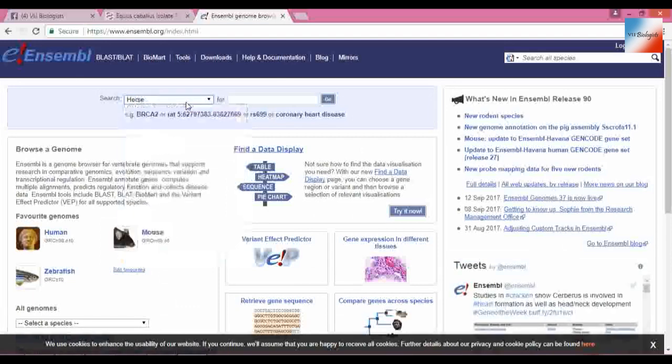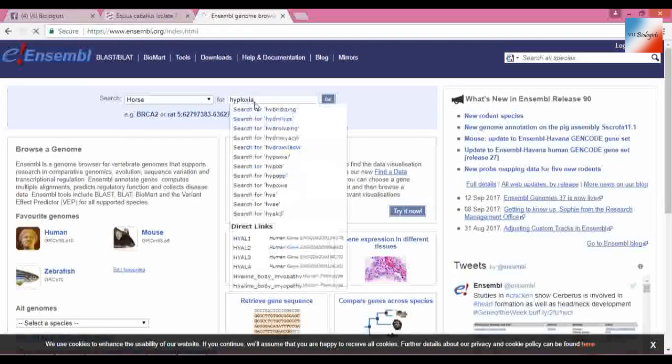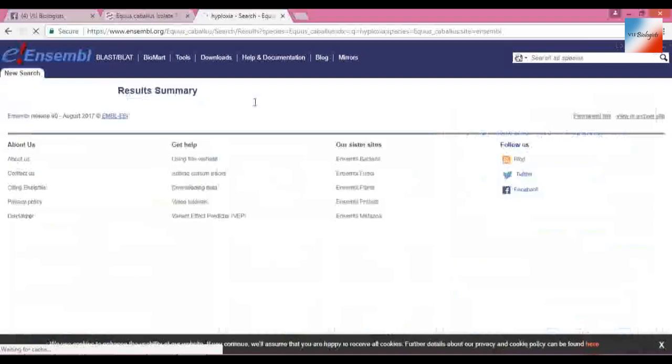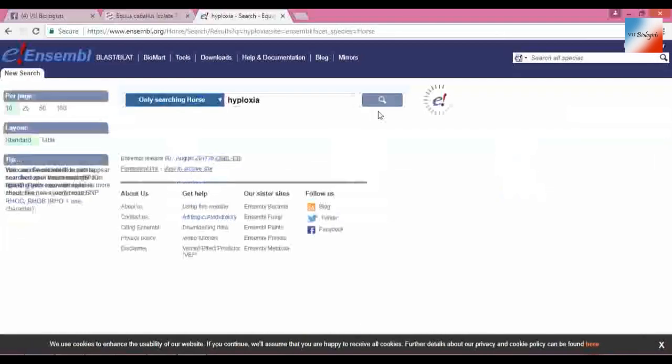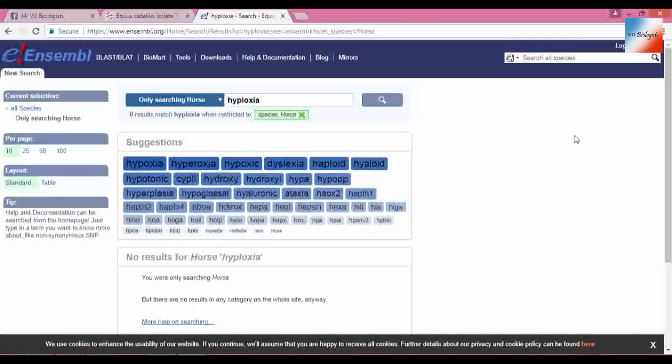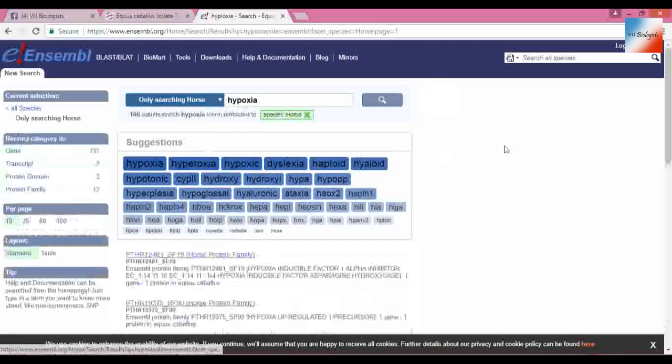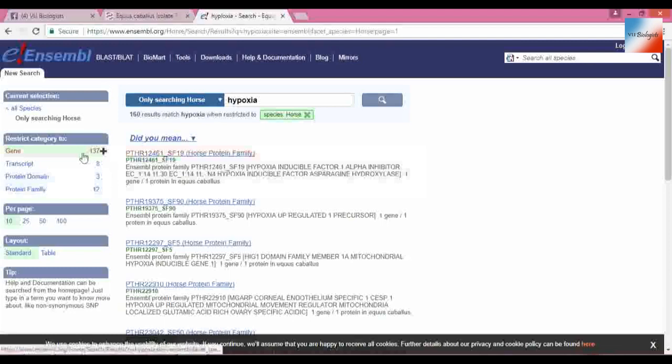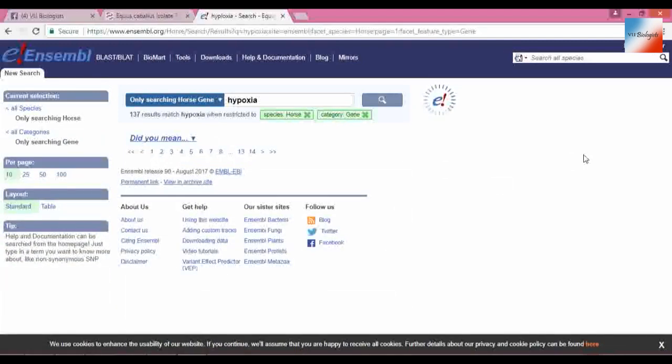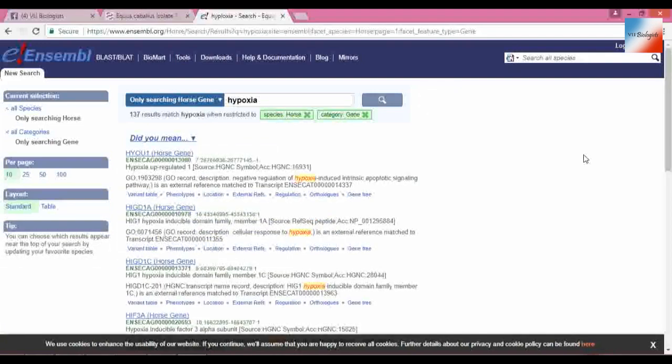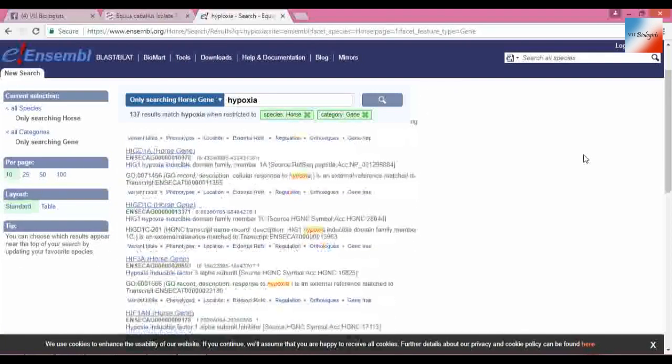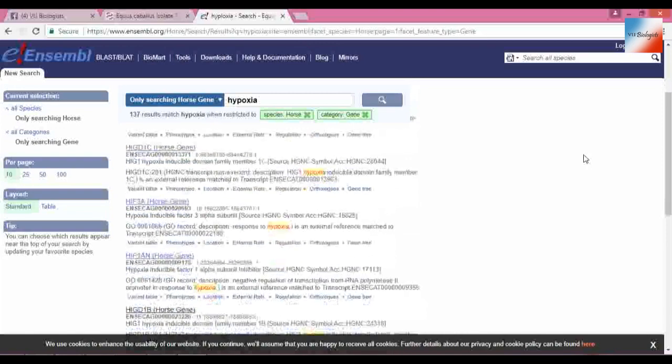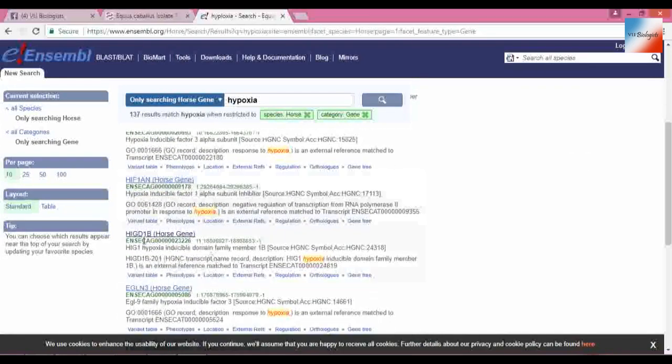Horse, and I will use the keyword hypoxia here. I know which sequence, which gene I'm looking for, that is hypoxia. And I will select the genes. There are 137 genes data online, and there are a lot of genes in the horse which affect hypoxia, but I'm looking for the specific gene.